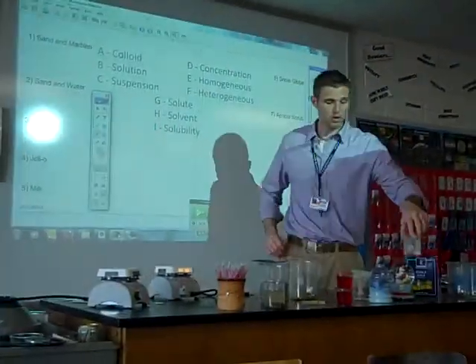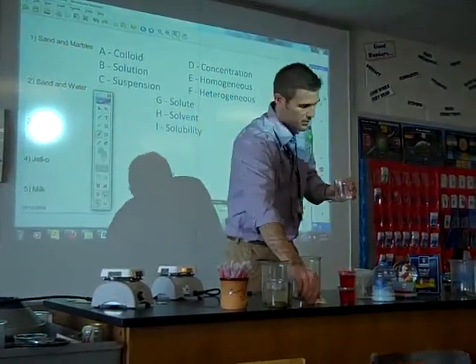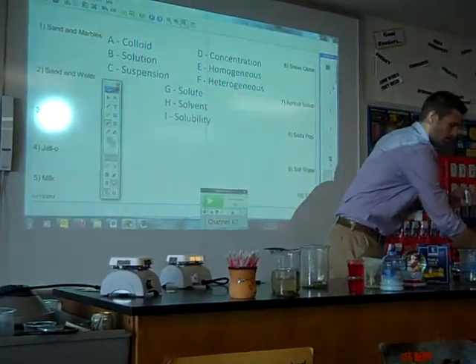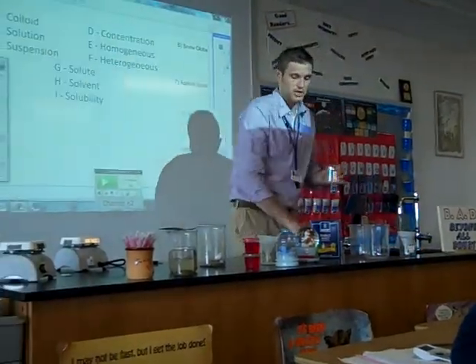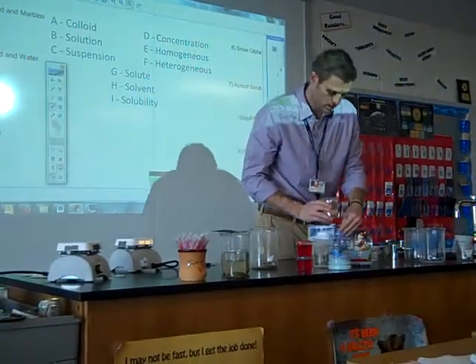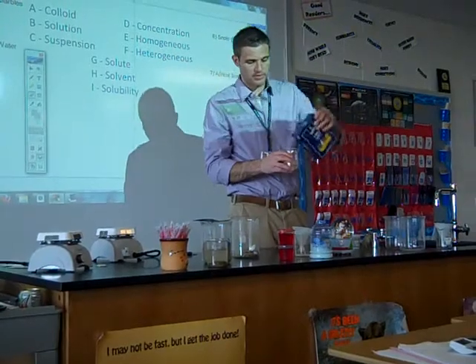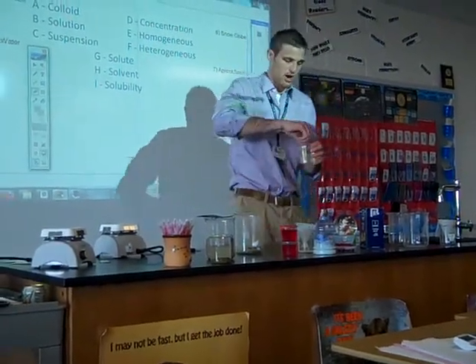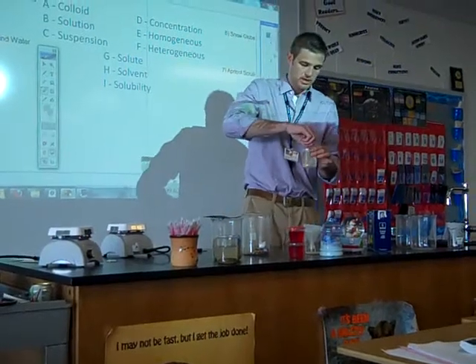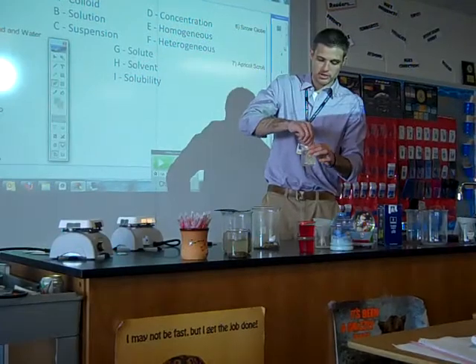Right here I have salt water, which I actually made first hour, so it's already a little bit dissolved. But I'm going to add some salt to it just to show you, so you guys know that I'm not lying. So here's some salt water, and I'm going to add a little bit more salt into it. Take my stirring rod, stir it up. Is this a solution, suspension, or colloid?